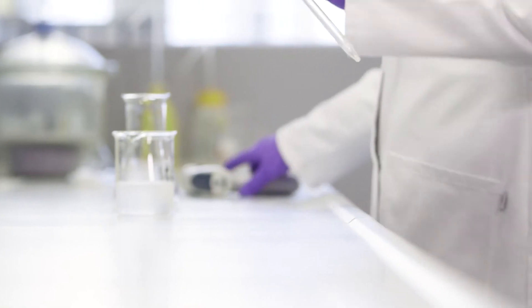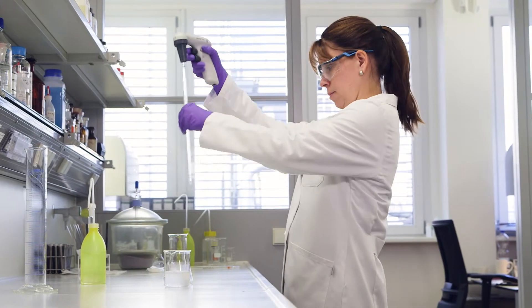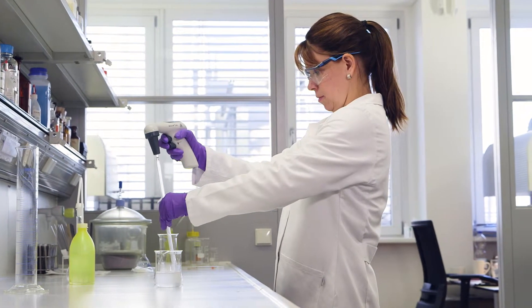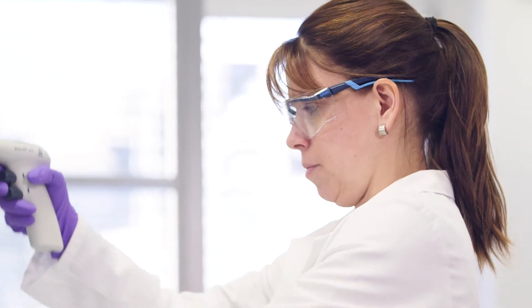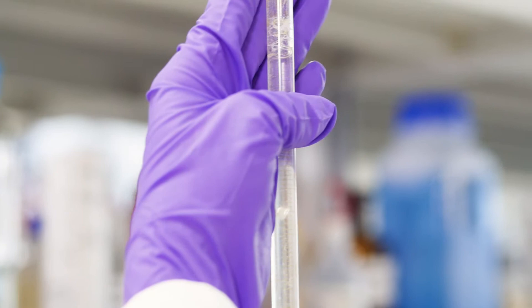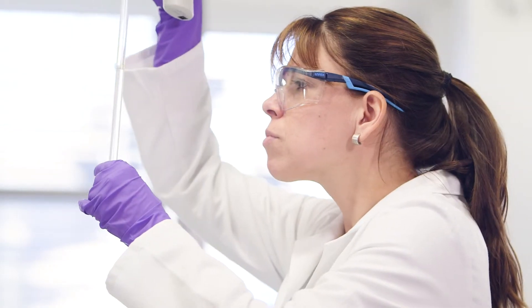The consequences of incorrect reprocessing may not only cause glass corrosion but also the removal of the imprinted markings. This shortens the lifespan of the glassware and can even lead to false analysis results.